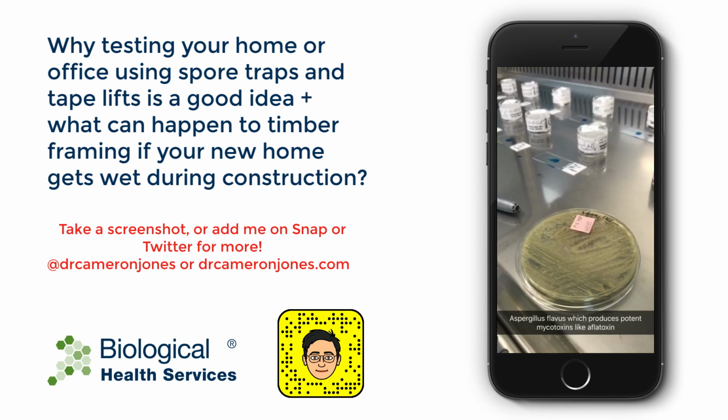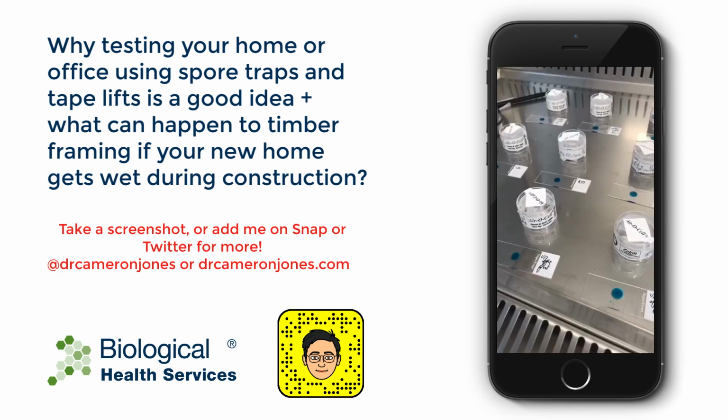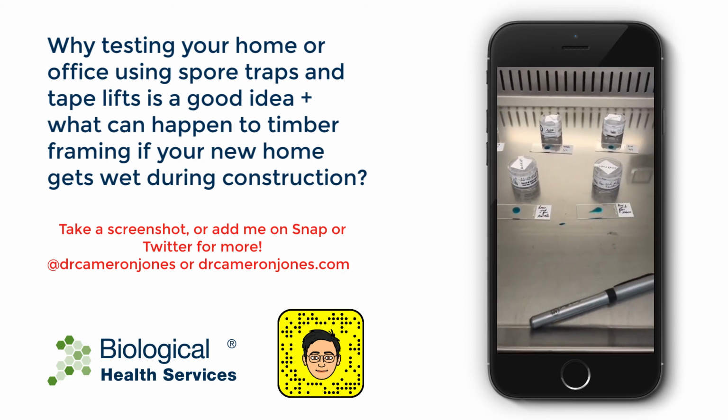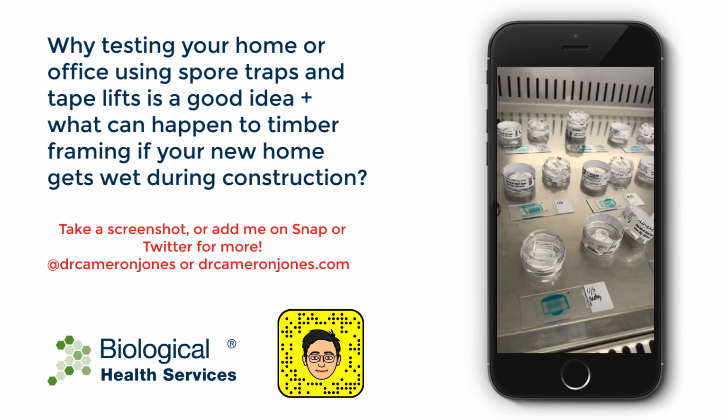Here's one of my reference cultures for Aspergillus flavus, very common indoor contaminant after water damage, and it produces potent mycotoxins. All of these spore traps represent different rooms or areas in a commercial shop which was flooded, and I'm staining them to reveal the mould spores.